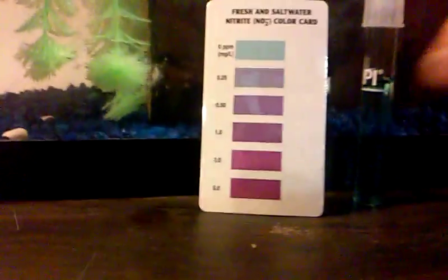Okay, there is zero — and that is how you test for nitrite.